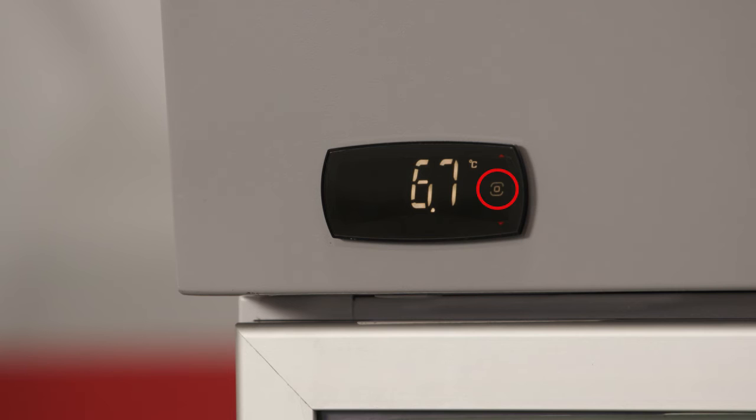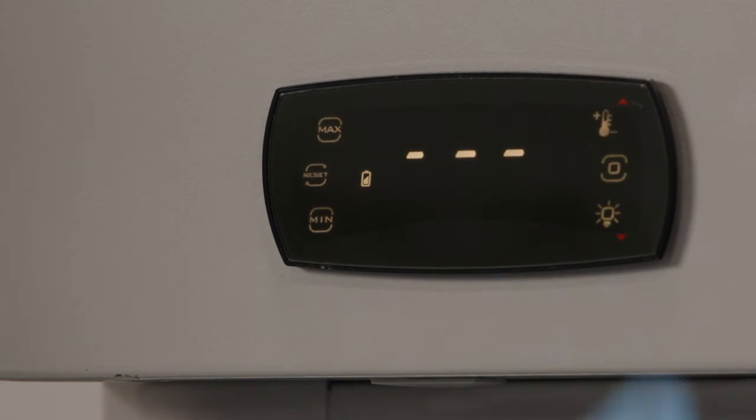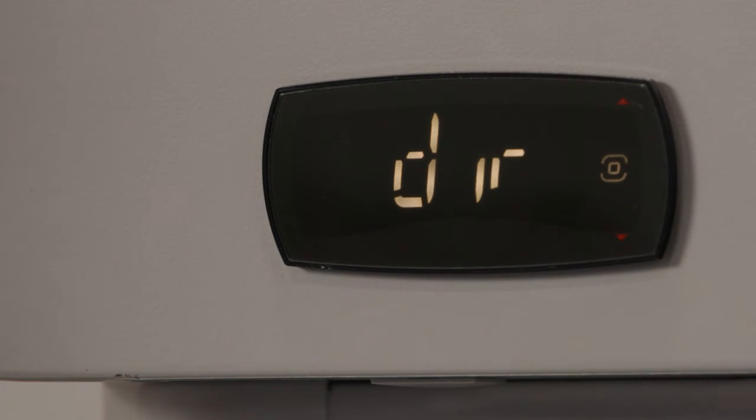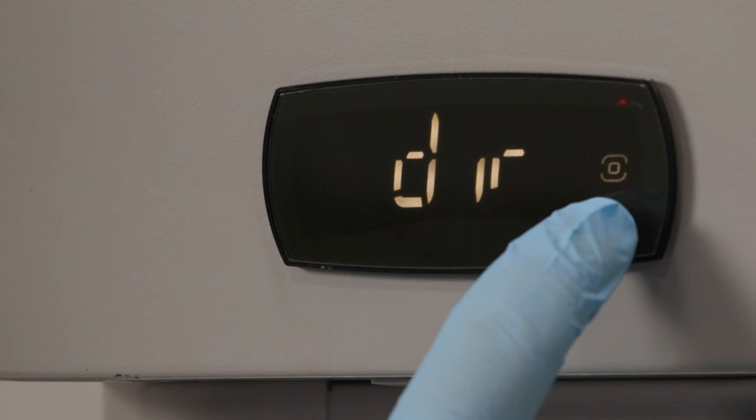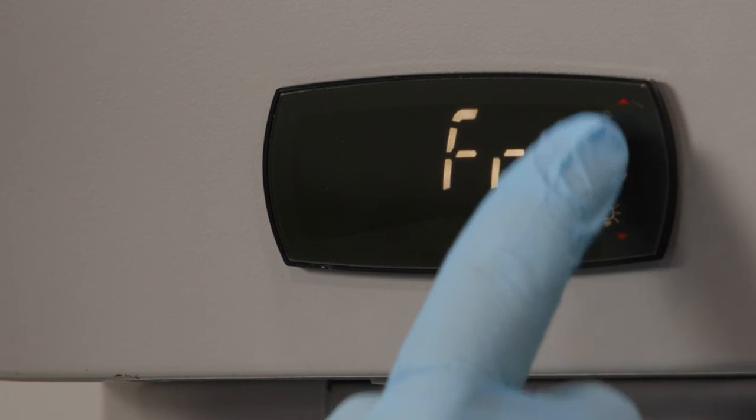Use the program button in the middle right position to access controller parameters and settings. Press and hold the button for 3 seconds to change the display. When 3 dashes appear, enter the direct access mode to change settings and active functions. Refer to the operations manual for a complete guide to accessing parameters and activating or deactivating functions.